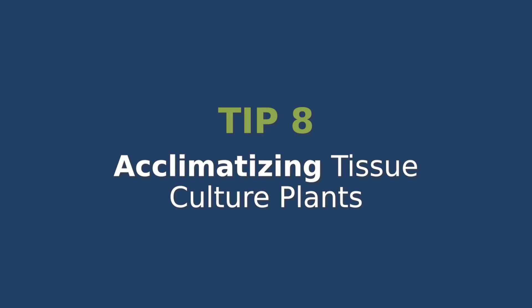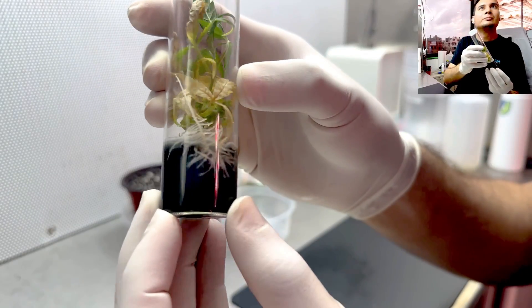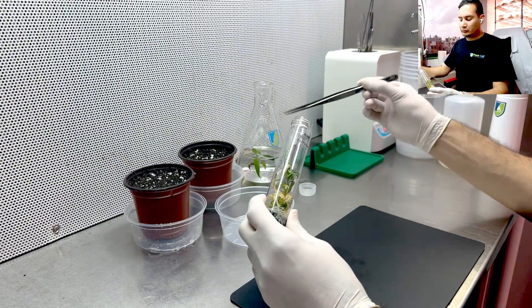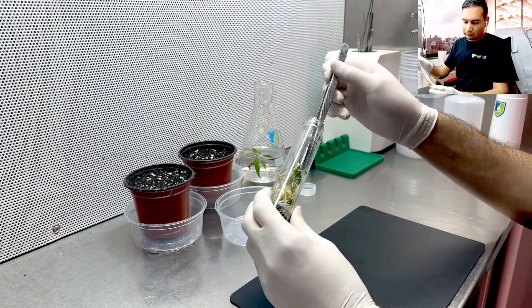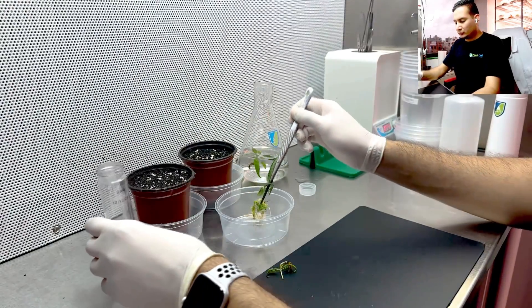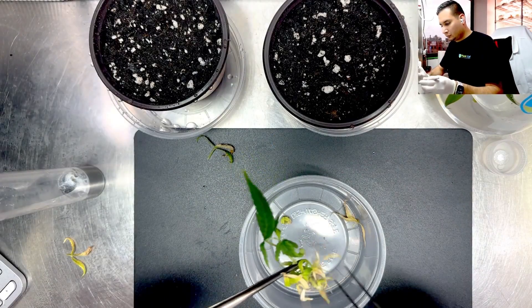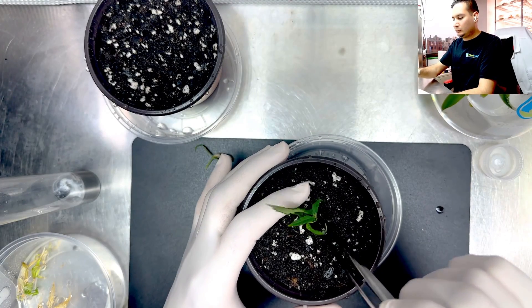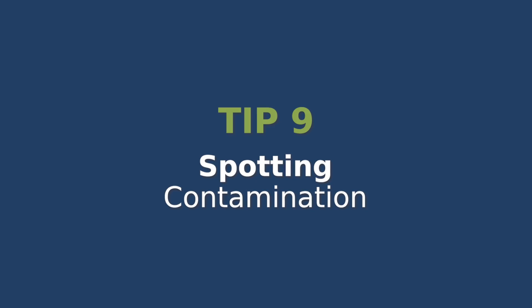Acclimatizing tissue culture plants. Once your plants have grown well in tissue culture and have developed roots, it is time to transition them into the real world. Remove the plantlets from the media and wash off any gel residue. Place them in a humid environment with some indirect light, and then slowly reduce the humidity over time. This helps them adjust to the outside conditions and thrive once planted in soil.